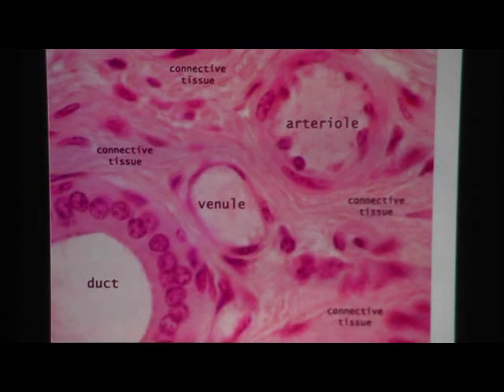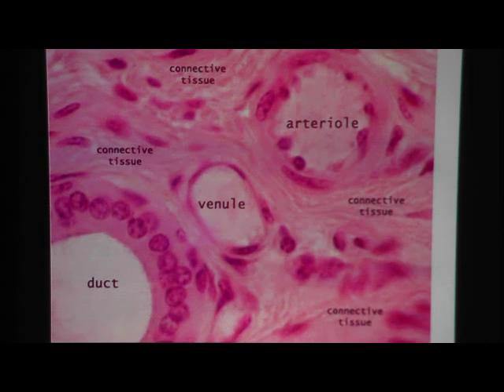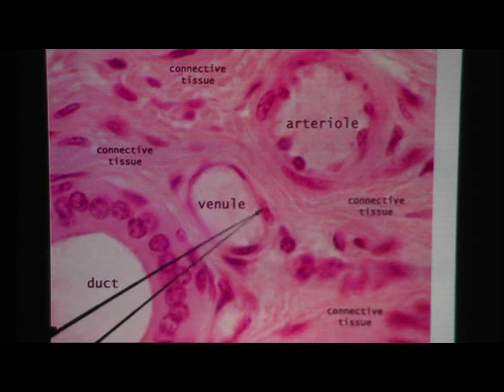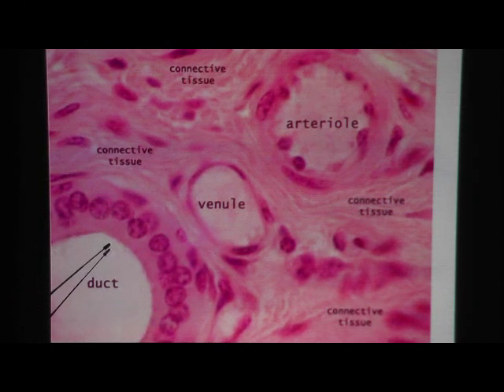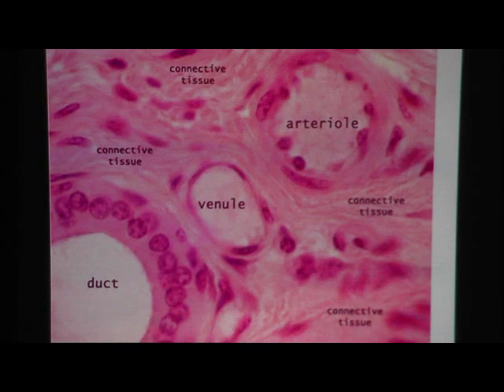Going back to this picture — you might remember seeing it with simple squamous epithelium. That portion was simple squamous epithelium, and this portion is simple cuboidal because it's lining a duct.